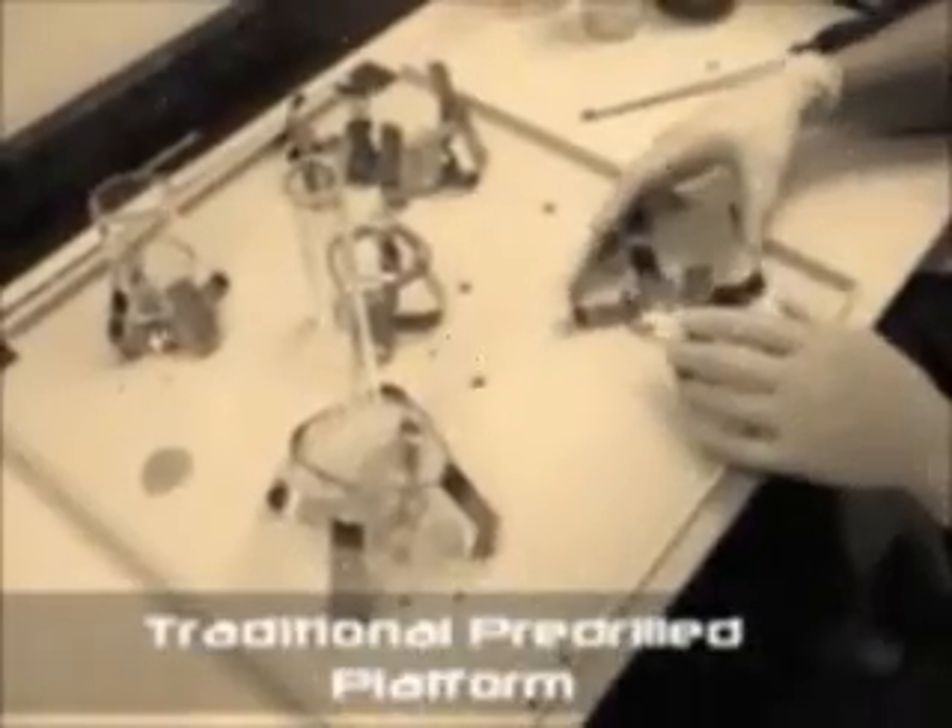Gone are the days of searching for the toolbox when changing the flask clamps on your old fashioned pre-drilled shaking platform. The tedious process of lining up a series of holes, locating the correct screw size and tightening 4 screws per clamp is a thing of the past.